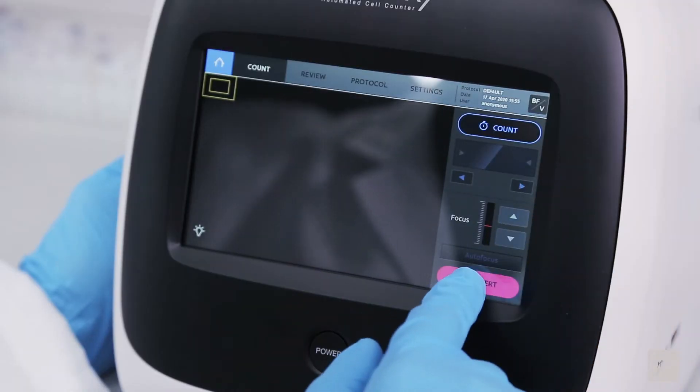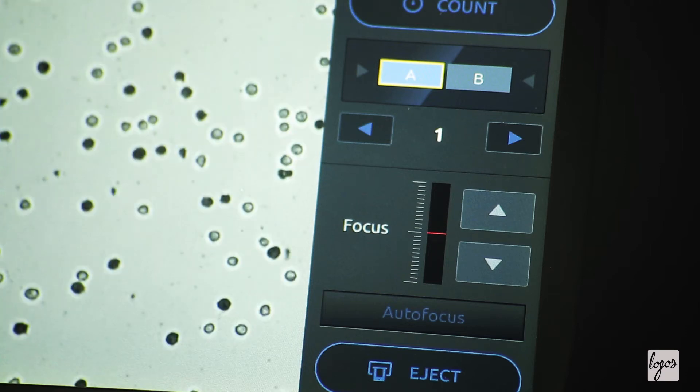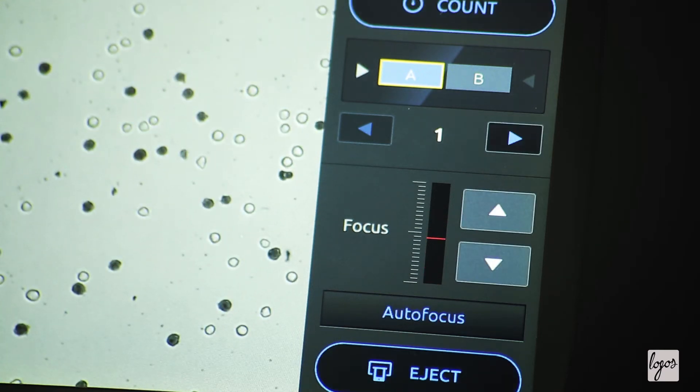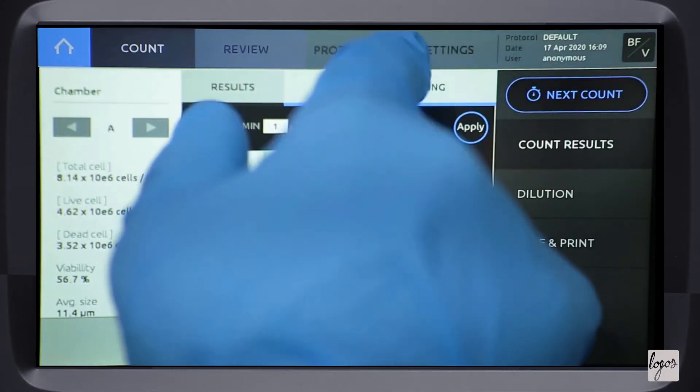Trademarked to all LUNA cell counters, the LUNA FX7 has a highly intuitive user interface that will streamline your workflow. Simply insert the slide and press count without any unnecessarily repeated motions.